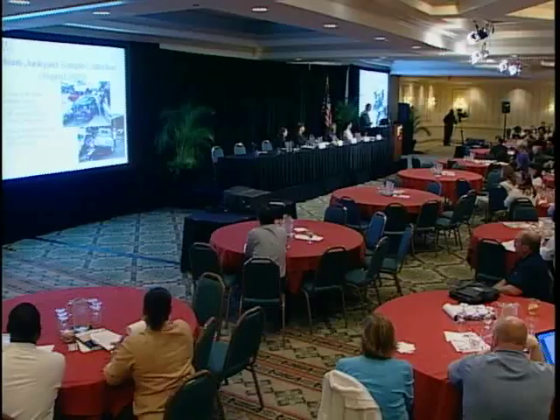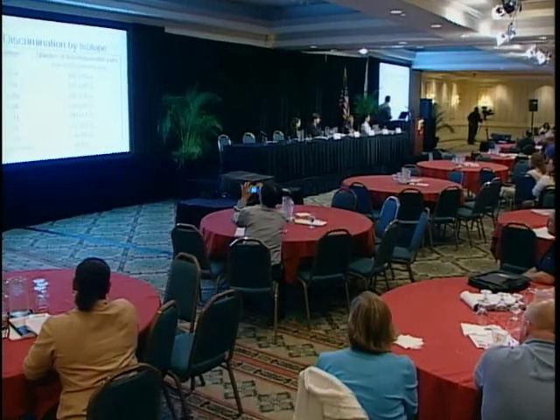And so we want to see how does it perform when you're trying to discriminate between very similar samples of glass. For example, windshields in cars or side windows of cars. So I asked one of my students to go out and collect glass from 14 different vehicles. These are cars that were manufactured between 1995 and 2005. And she collected 41 different glass samples from 14 different vehicles. And I asked her to analyze them by this method.